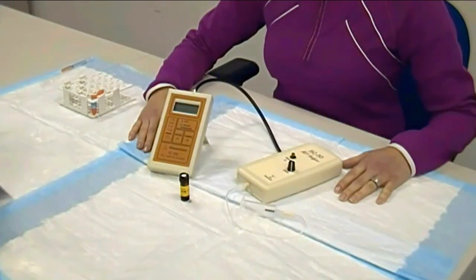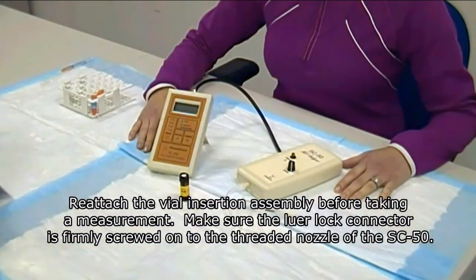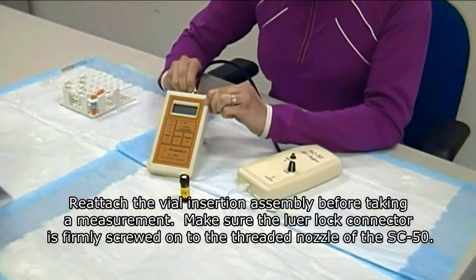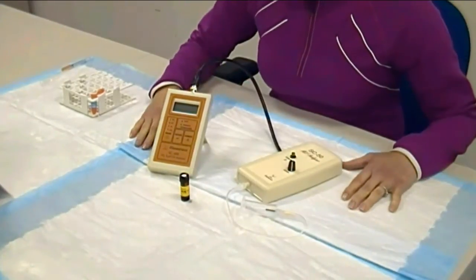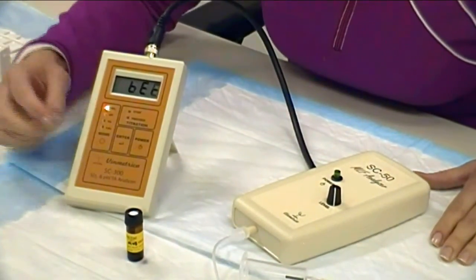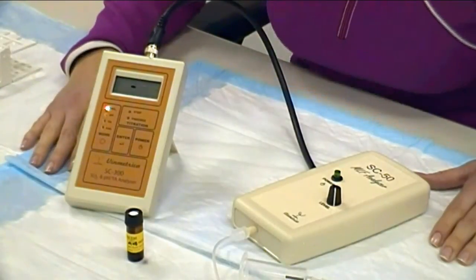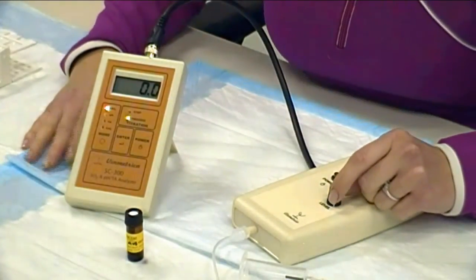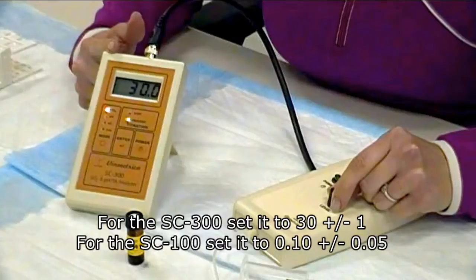Our sample has just finished incubating for 30 minutes. It's time to take its first measurement. To set up your SC50, connect through the B and C connector — gently push down and twist. Turn on your SC300 by hitting the power button. Make sure your SC300 is in SO2 mode and hit enter. Turn on your SC50 by pushing the green power button. The SC300 will read zero; you would like it to read 30 plus or minus one. Turn the level knob on the SC50 until you reach 30 plus or minus one. For the original SC100, set the instrument to 0.1 plus or minus 0.05.